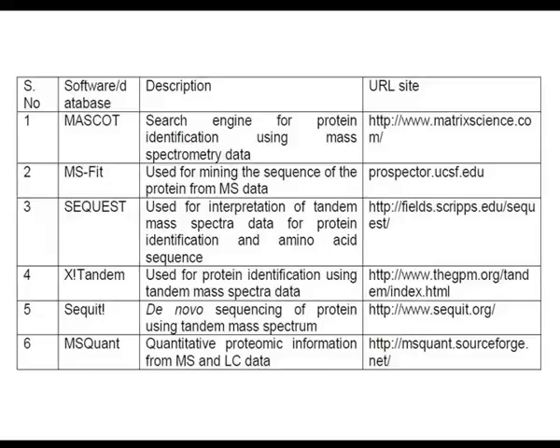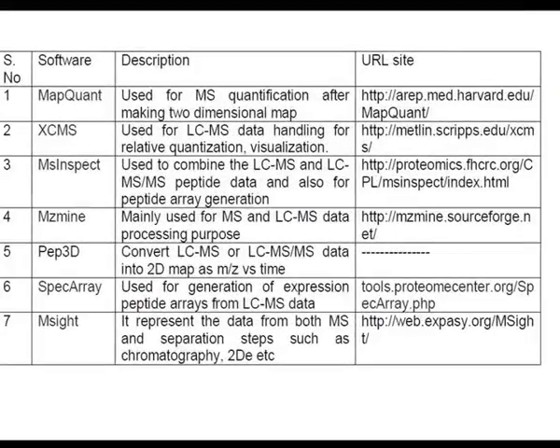Mass spectrometry has succeeded in identifying proteins based on the amino acid sequence information derived from the tryptic digested peptides. To analyze the data obtained from the mass spectrometry, sophisticated databases for protein identification were built, and PMF (peptide mass fingerprinting), PFF (peptide fragmentation fingerprinting), and MS ion search are the foremost. In the last 2 decades, many algorithms and new tools were developed to process the large data sets.